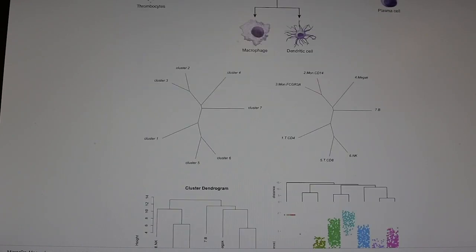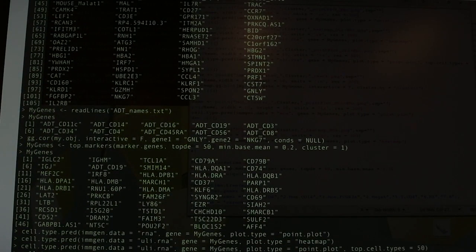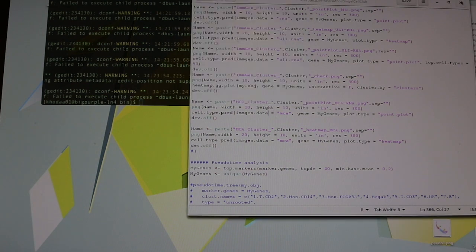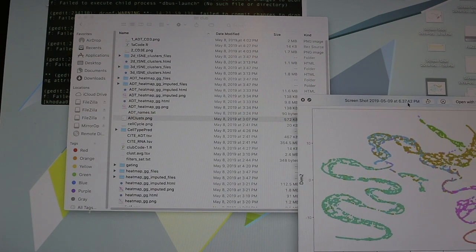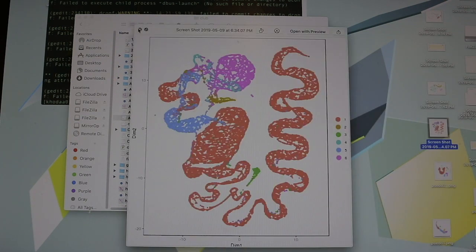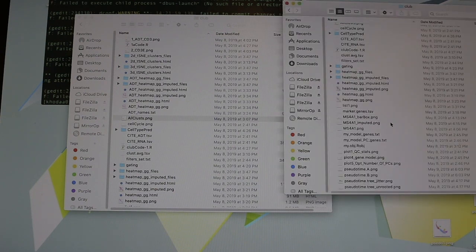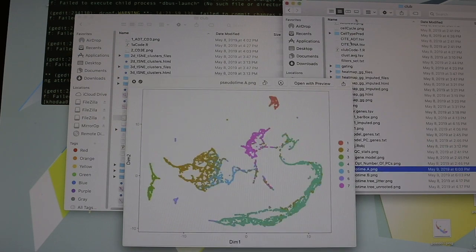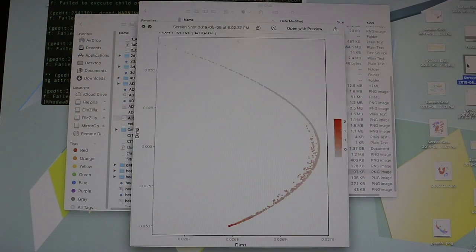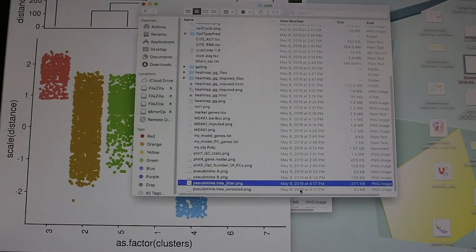You can also do pseudotime with it too. And we're playing with some versions of diffusion maps that keep pseudotime trajectories and stuff. That kind of looks like snakes. Whoa. These are developing and coming soon, kind of this or kind of these. And if you wanted to have it simpler like this, then you can do that too. Very artistic. Or something like these guys or these guys.